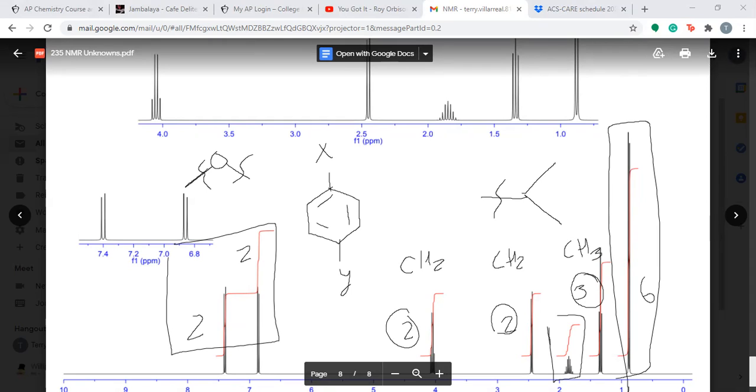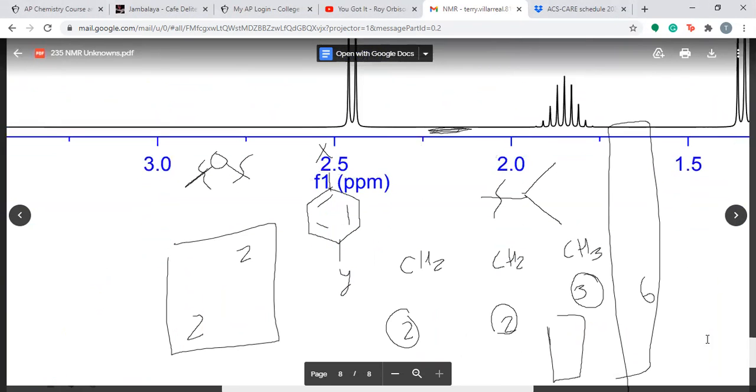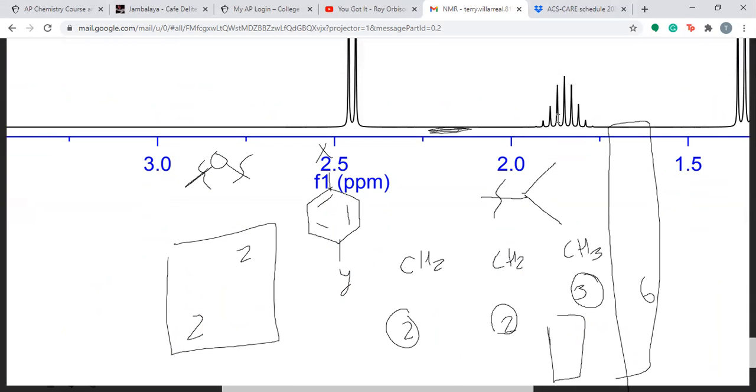So again, in the field of dirty tricks, we have to take a look at this. How many peaks are here? 7. There's 9 at the very edge. Again, this is what we call a dirty trick in the industry. So I'm going to zoom in just to show you guys what I'm talking about, as I scroll up, right? So you can see here at the very left side. So my CH has the isopropyl, the 2 methyls to the right. What has to be to the left?